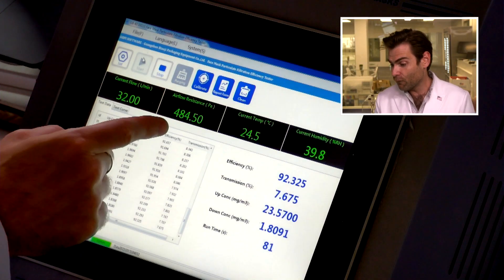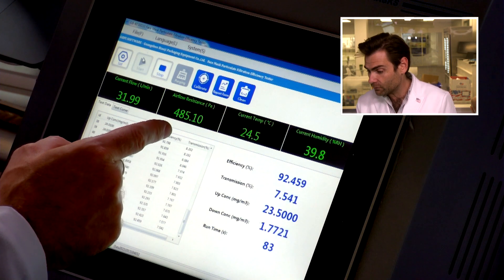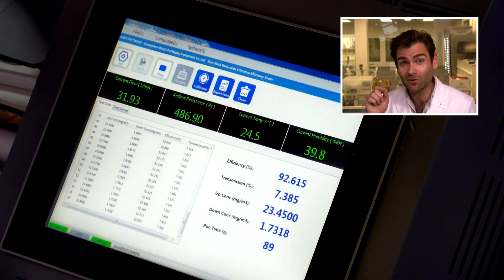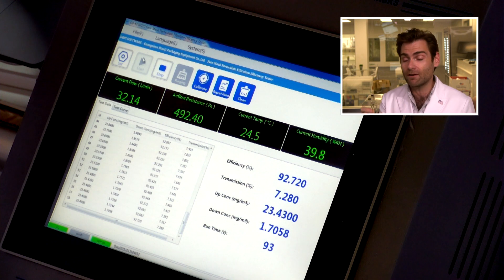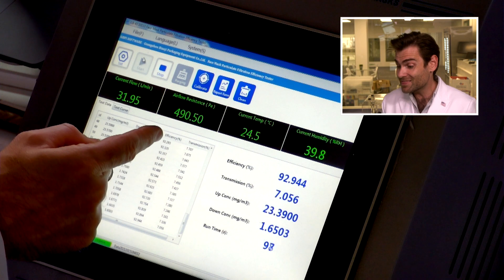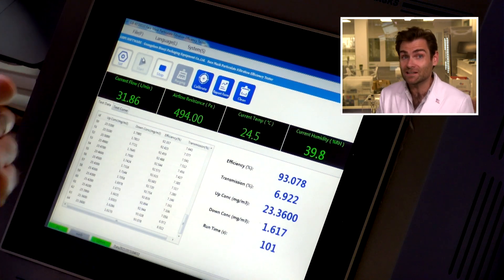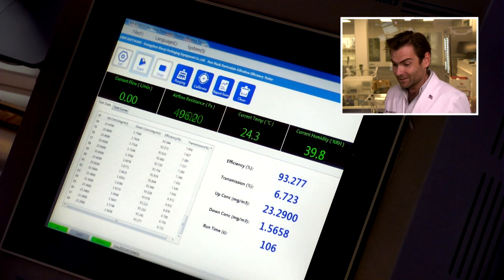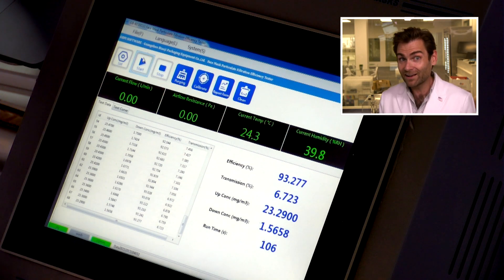Holy shnikes. Moving over to the machine: 484 airflow resistance. That is horrible. This number here needs to be about 150 pascals to be breathable for the average human. For a child, I want it to be closer to 100 pascals. This machine tops out at 500 pascals — it does not accurately measure above 500 pascals. This is the least breathable mask I have ever tested.